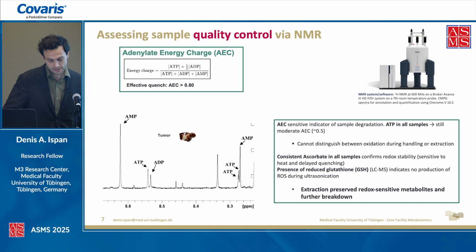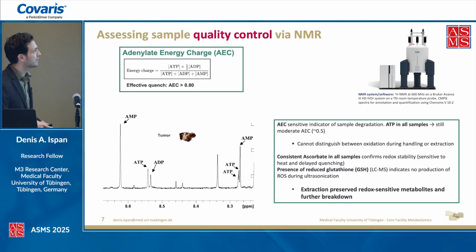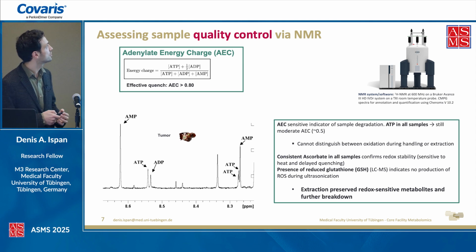First of all, to assess the sample degradation during handling and extraction, in collaboration with our NMR group, which is also led by Dr. Trautwein, we performed some complementary quality control. For that, we calculated the adenylate energy charge.